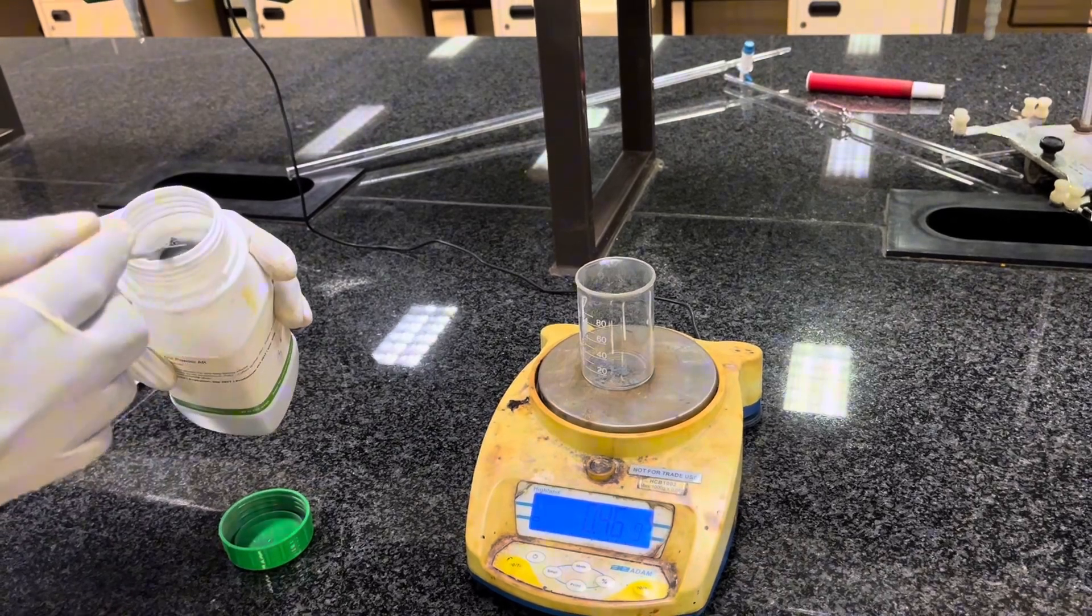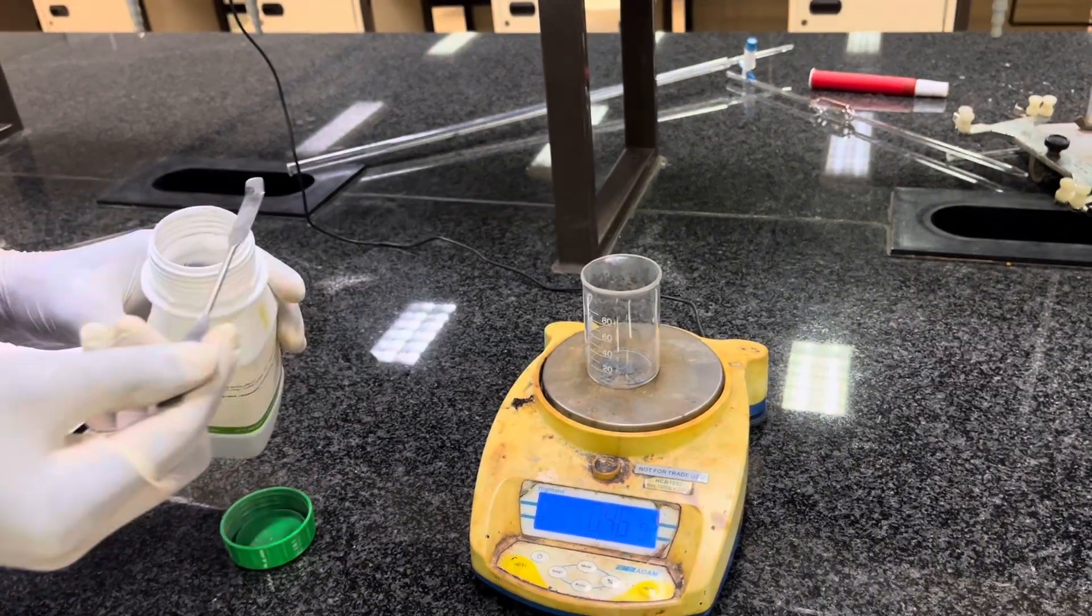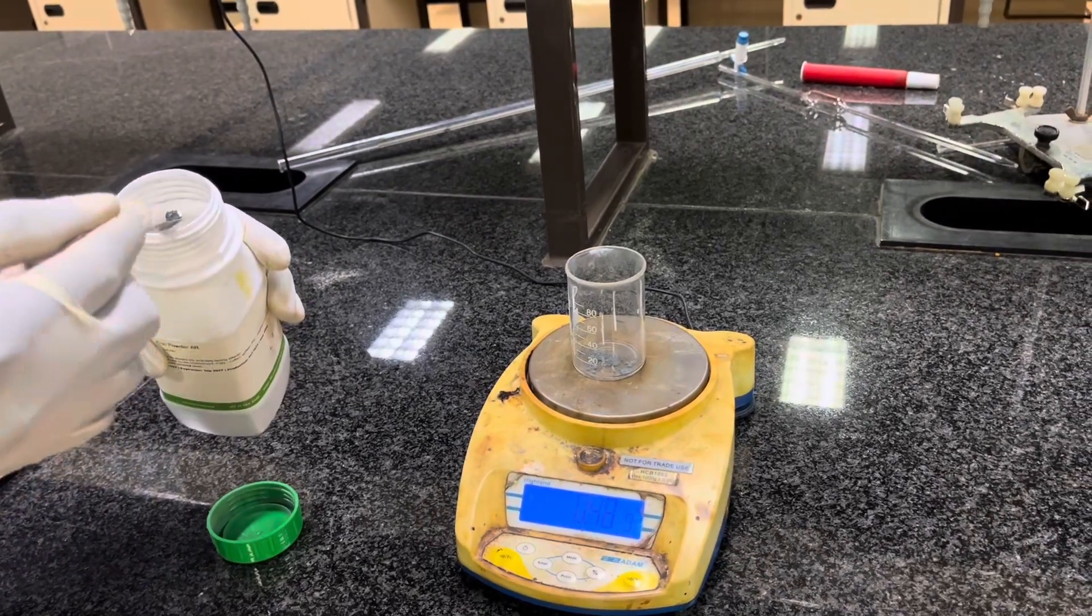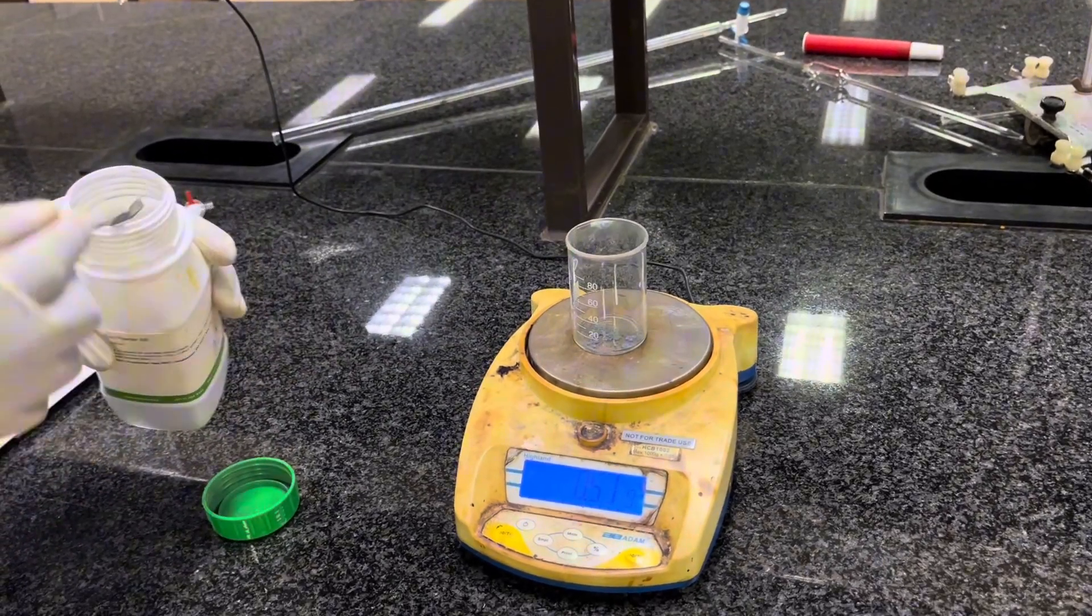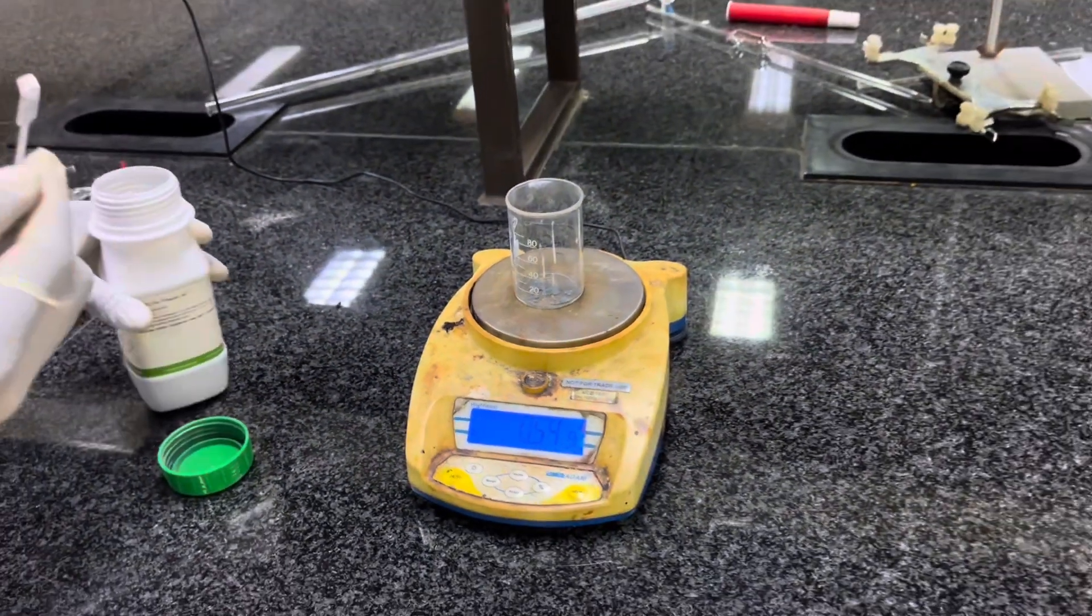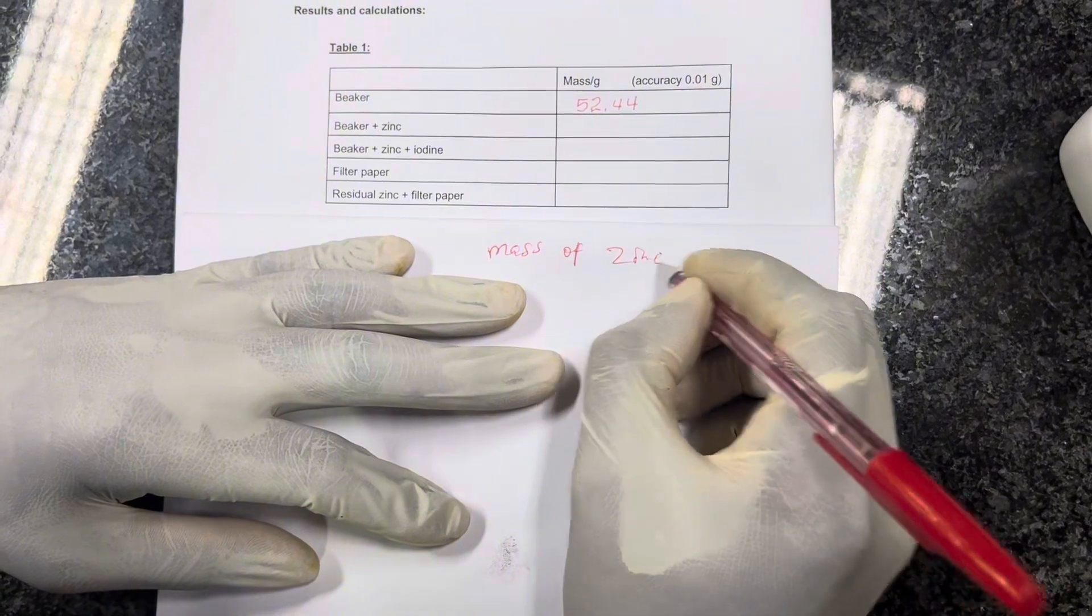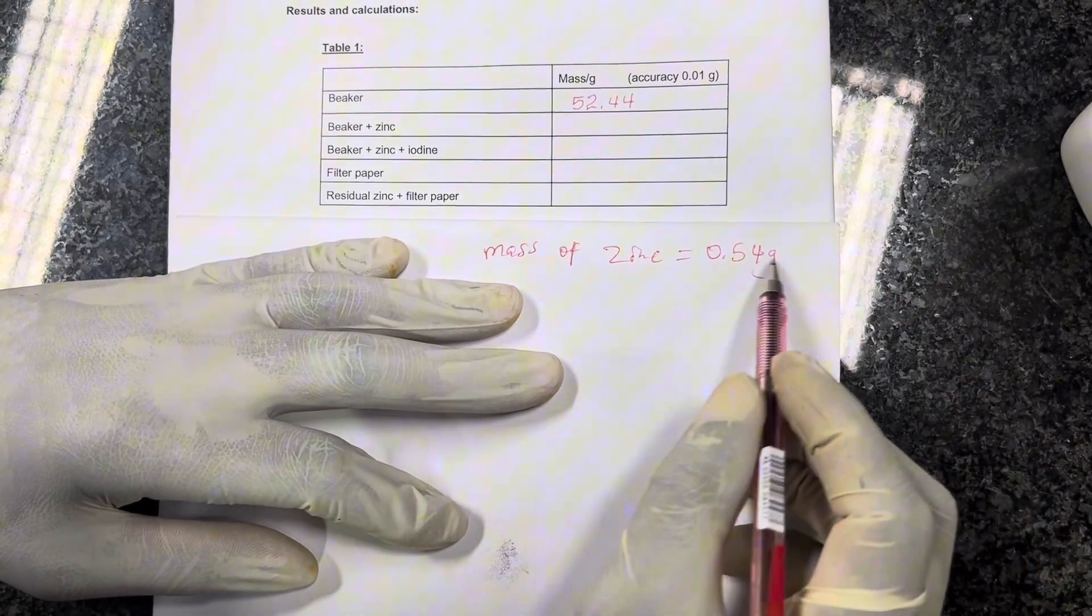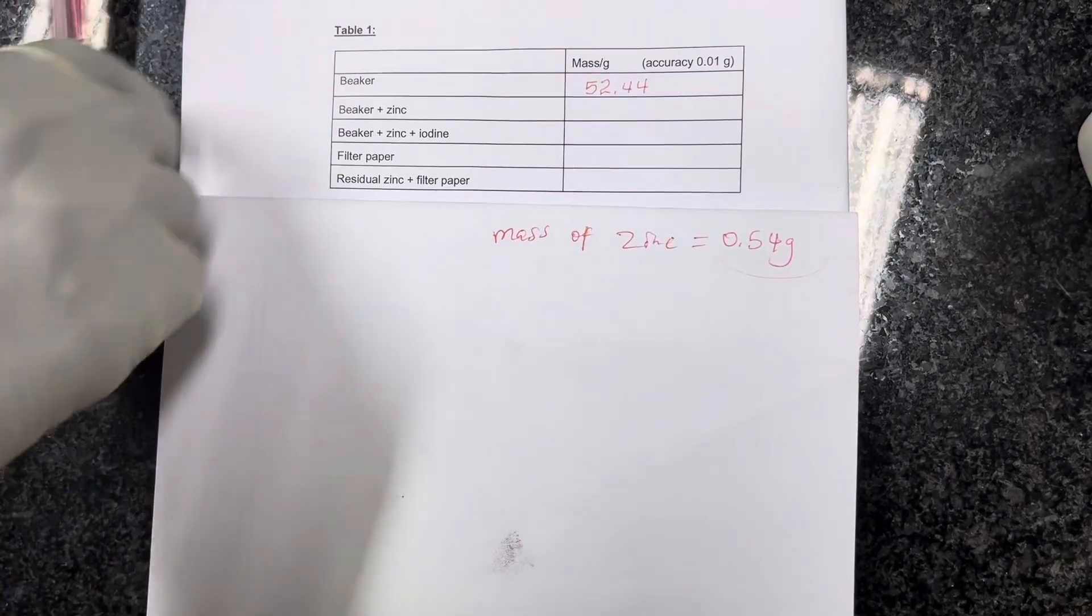If I were to add a spatula in its full capacity, I may encounter a challenge whereby the mass reads more than what is required or more than what I need. That's why I prefer to add it bit by bit. I will keep on adding. Now it's approaching 0.54 that I need. Yes, that's the mass that I want as far as this experiment is concerned. So I will record it down and write mass of zinc. Remember, this is the mass of zinc alone, which is 0.54. The mass of the beaker is not accounted for here because I pressed the tare button. So it's not accounted for. But we know the mass of the beaker alone is 52.44.